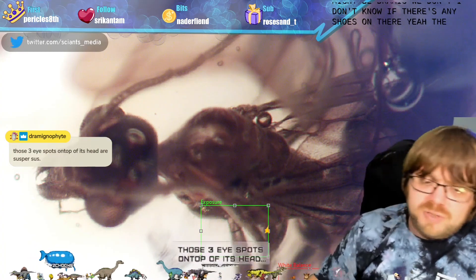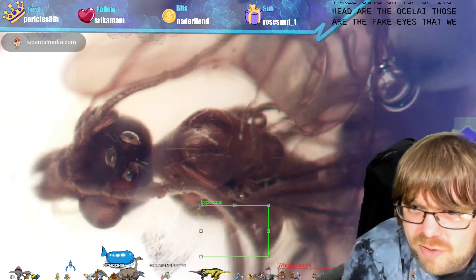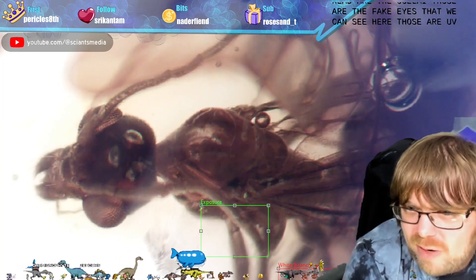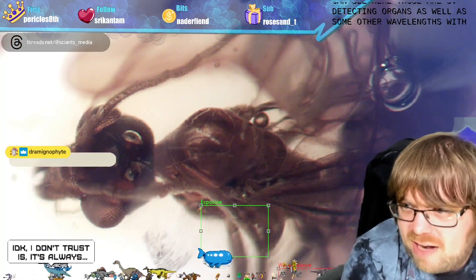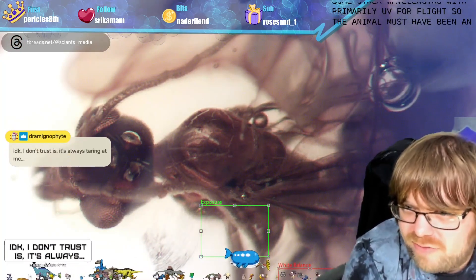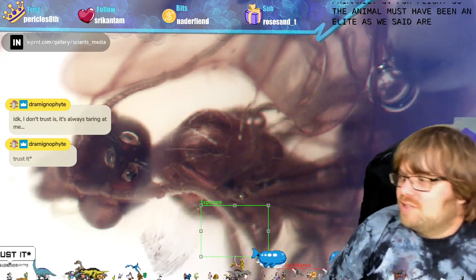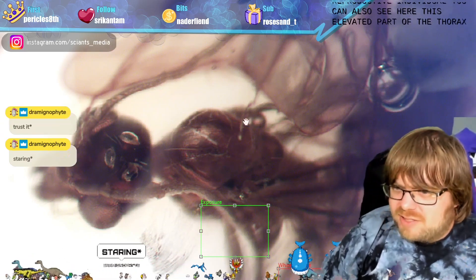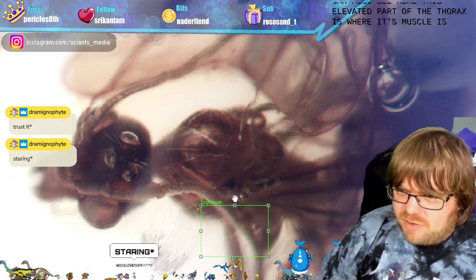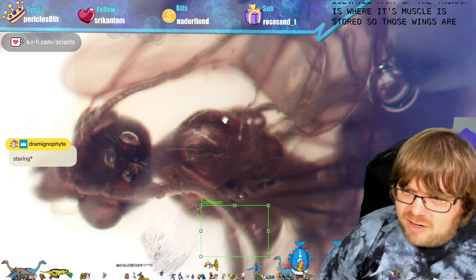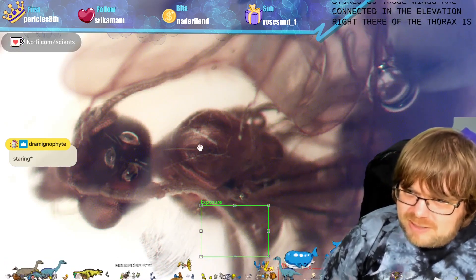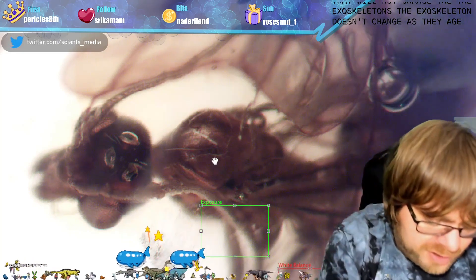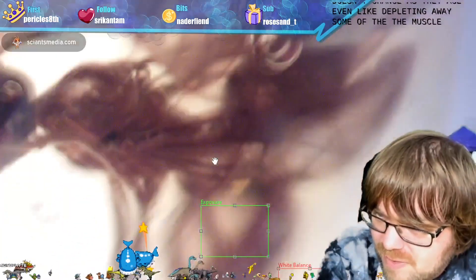The three dots on top of its head are the oceli - those are the fake eyes, UV-detecting organs, as well as some other wavelengths, but primarily UV for flight. The animal must have been an alate - a reproductive individual. You can also see this elevated part of the thorax is where its flight muscle is stored, so the wings are connected there. That elevation in the thorax is all muscle tissue.